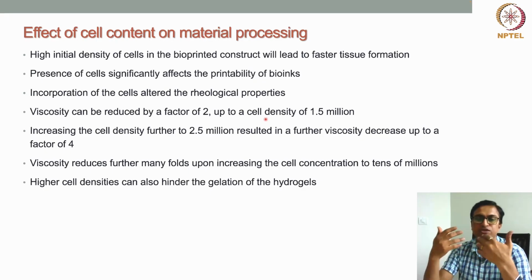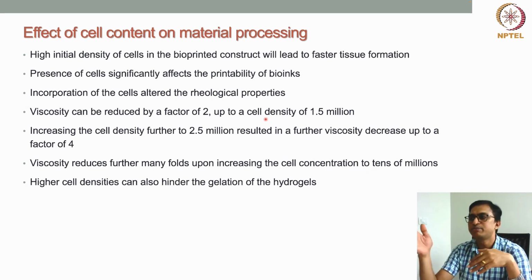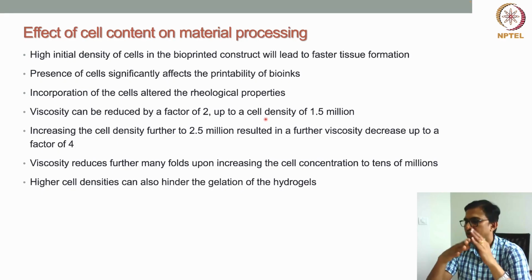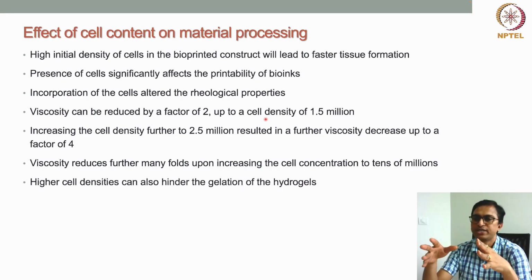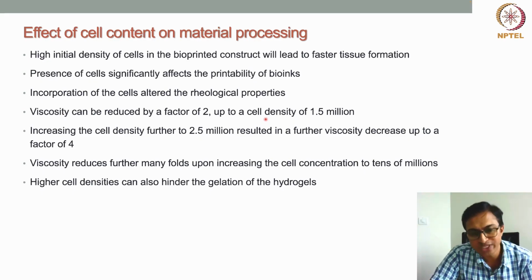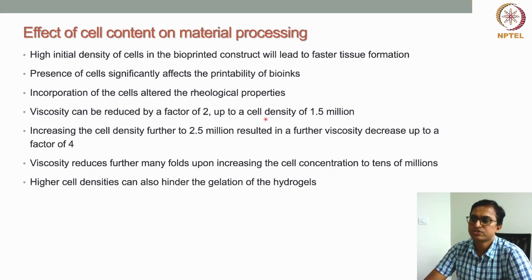And viscosity can reduce further if we keep on increasing the cell concentration. Suppose our interest is to increase the cell concentration to 10 million or 100 million, so you can imagine the viscosity can be reduced by many folds, and that will definitely alter the whole equation of your printability. So then you have to work very hard to print a structure with the reduced viscosity of the bioink.